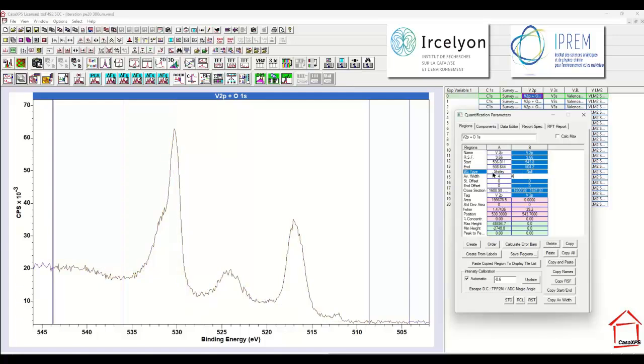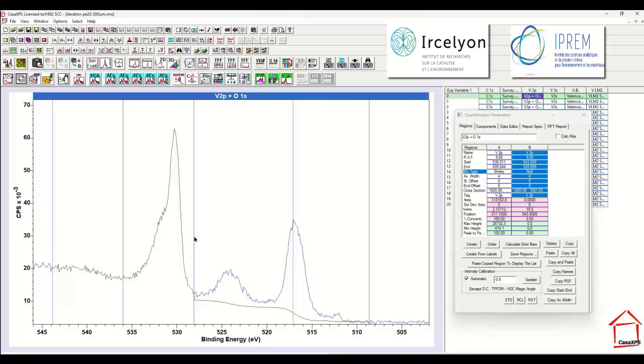and I'm going to enter null, and what you will see over the span of this second interval is that the data now turns the color of the background. So what's actually happened here is this null background is returning the background to the data. So if I want to choose a different limit for this second background, I moved up the background limit so it's encompassing both the oxygen and some of this background.